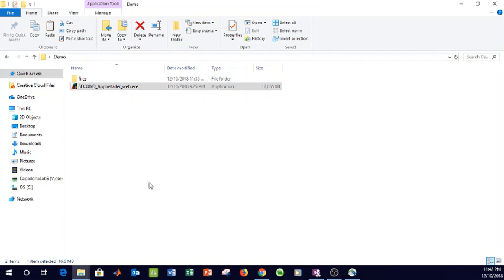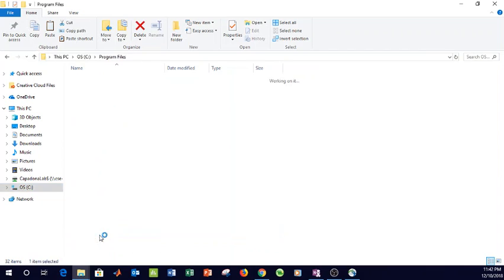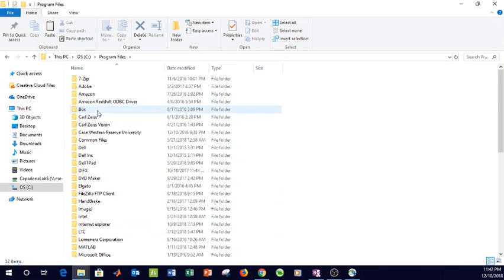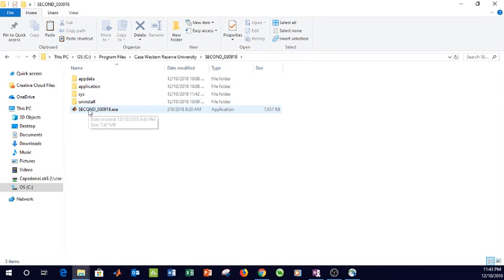And you will find your brand new installed program under the C drive, Program Files, Case Western Reserve University, and Second. The version that you'll have is 030918. And to open the program, we just double click Second.